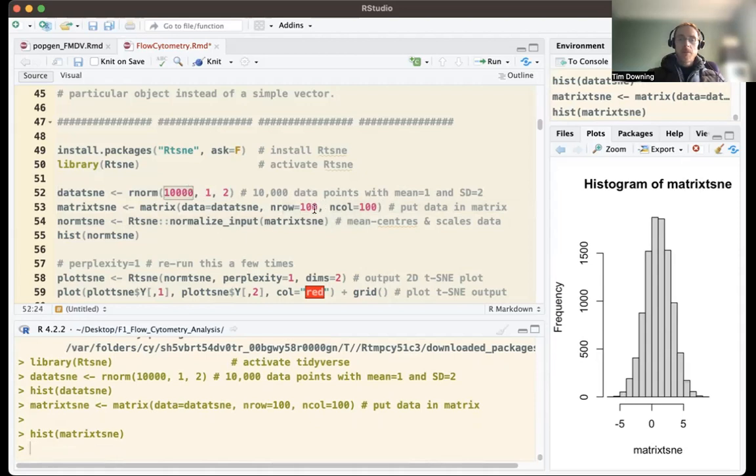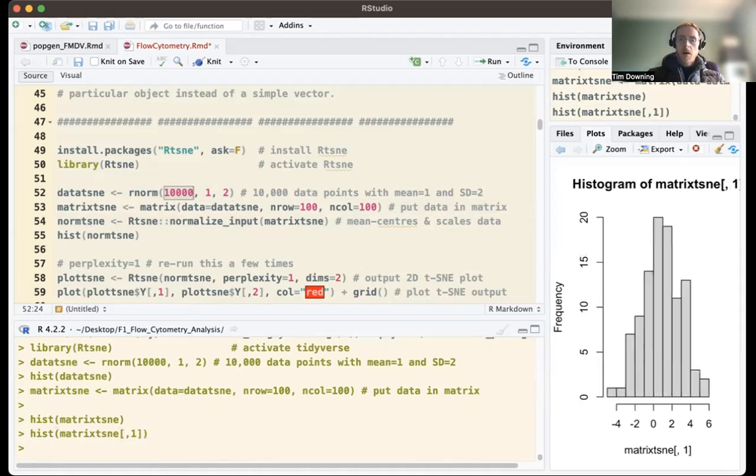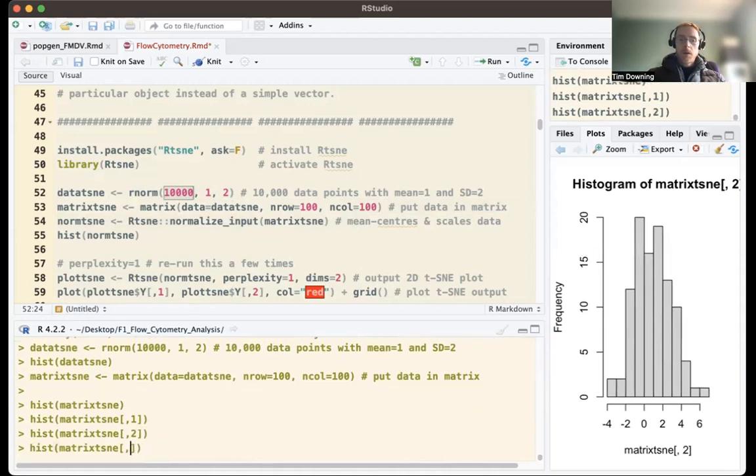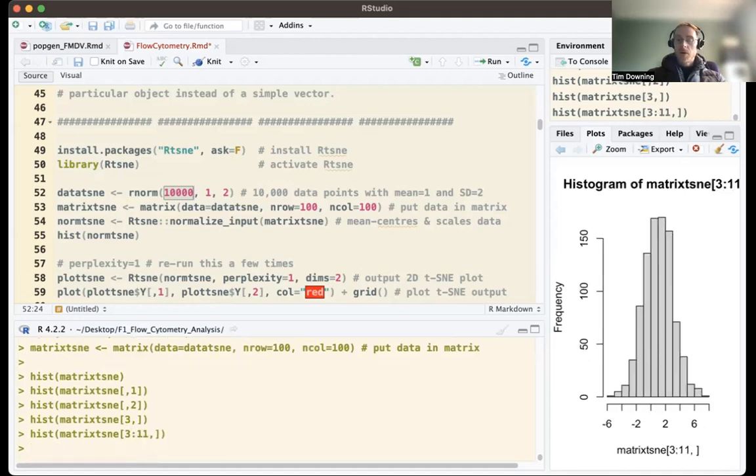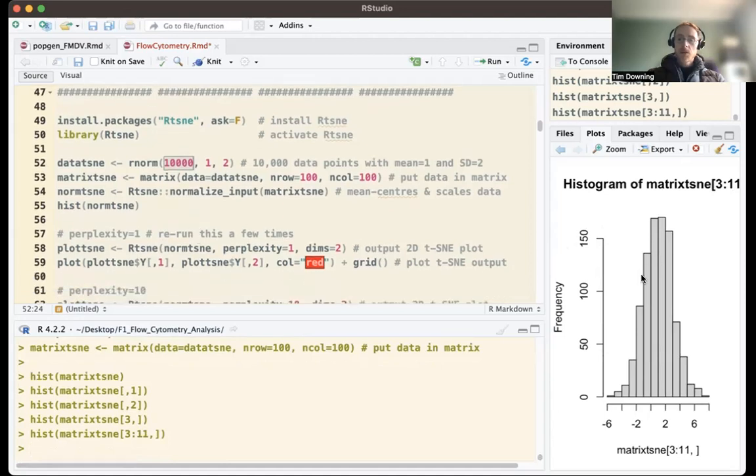So it's a matrix with some noise. If you look further and do a histogram of any particular subset of that, you'll find that, relatively speaking, you get a fairly normal distribution. It just might have more noise if you subsample it more. So any differences are just subsampling issues.